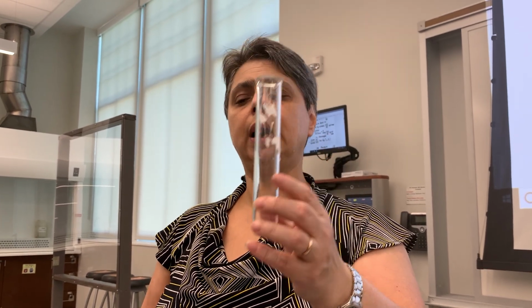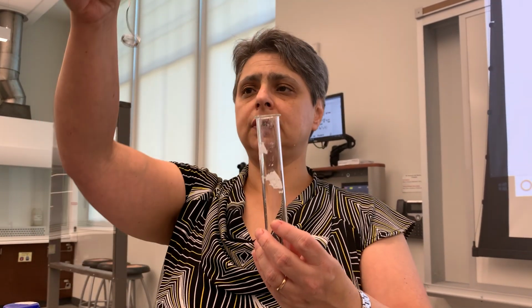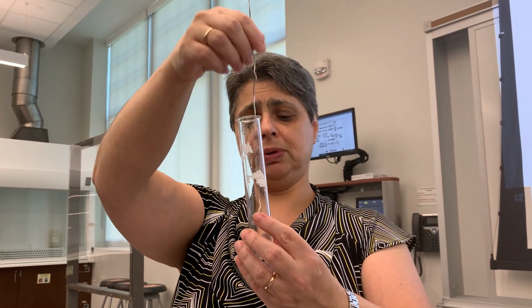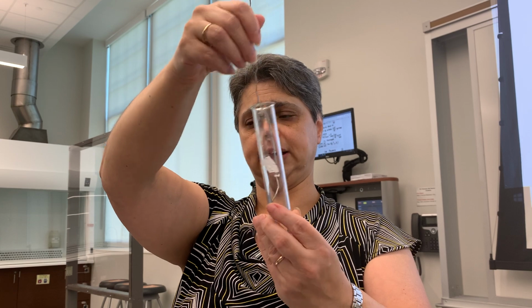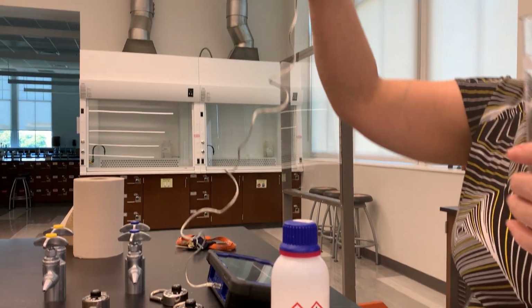You would then measure the freezing point of the pure solvent by placing this aluminum wire with a loop on the end, that's your stirrer, inside the test tube, and make sure it can be moved up and down like this. You would follow temperature changes with a temperature probe that's attached to the data logger.